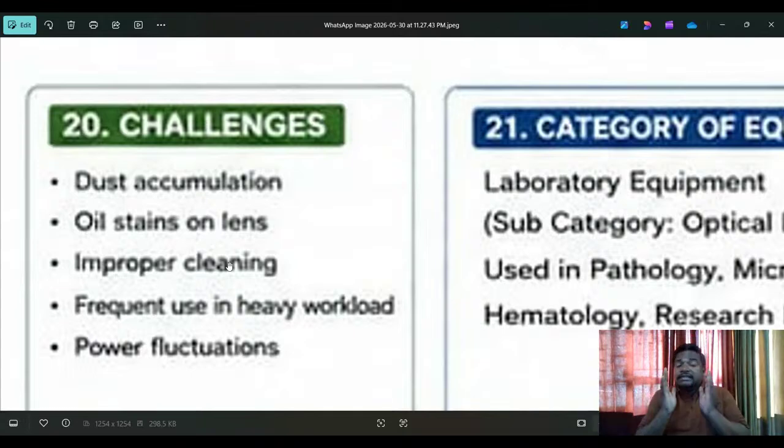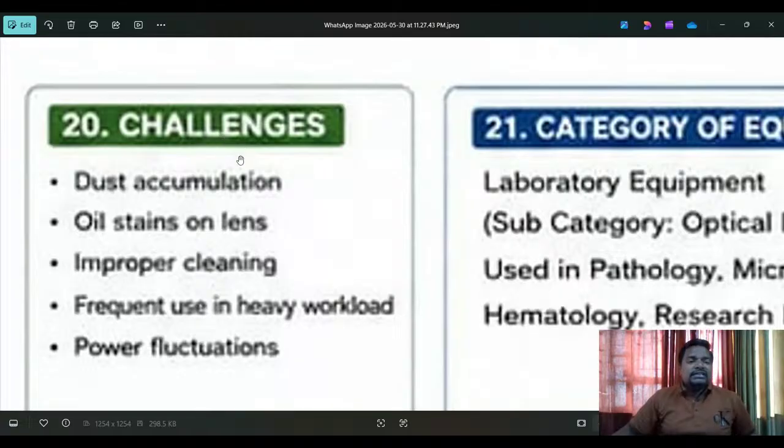In this live session, what I'm going to say is that as a biomedical engineer you have to find out the issues and resolve them. Replacing the spare part is not our priority. Understand? We have to have skills. If you don't have skills properly, try to engage with my live sessions, get the information, and implement it in your day-to-day life. As a biomedical engineer, do not do courier work from here to there. You have to do technical work. That's the reason I came back to this live session. Okay, these are the point 20 challenges.